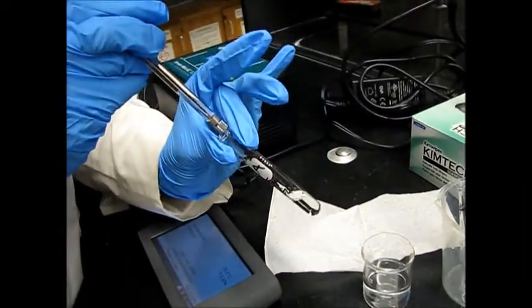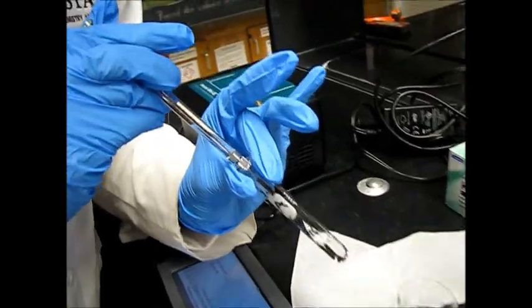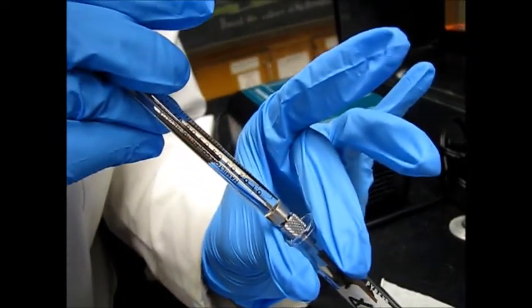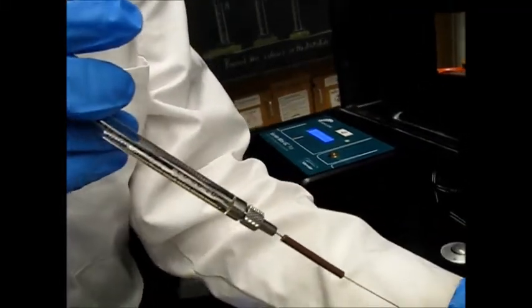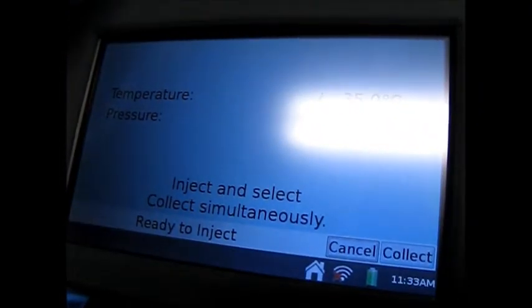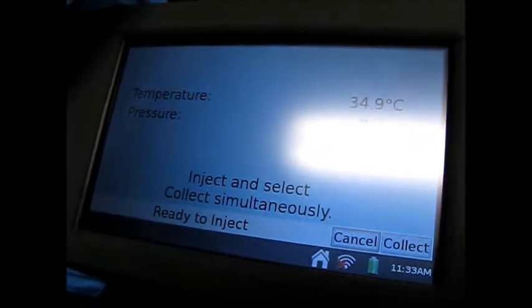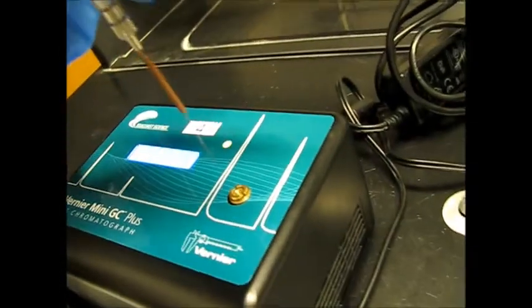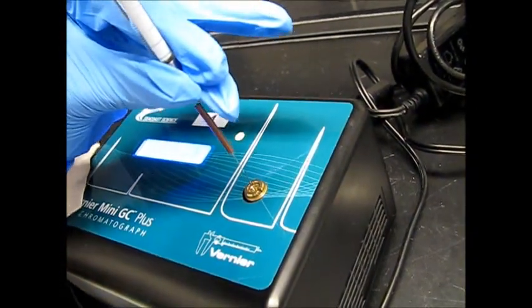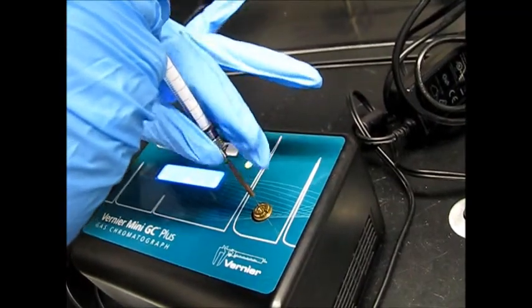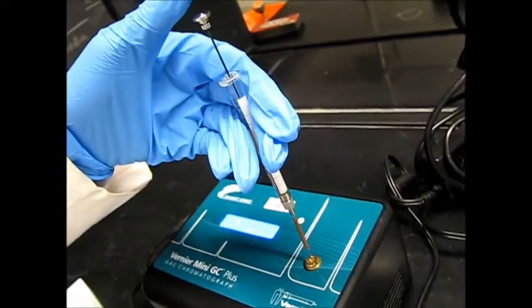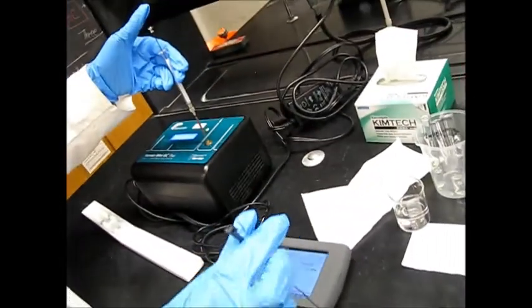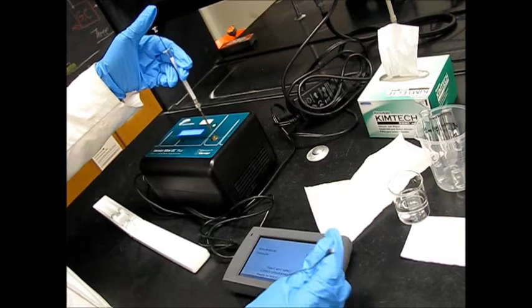Okay, so now I'm going to actually get my sample. I got 0.4. And now we can also see that the GC is ready. Okay, inject and select simultaneously. So GC is ready. Therefore, I'm going to insert my needle. And green light is also there. Slowly insert. And now our needle must be straight.